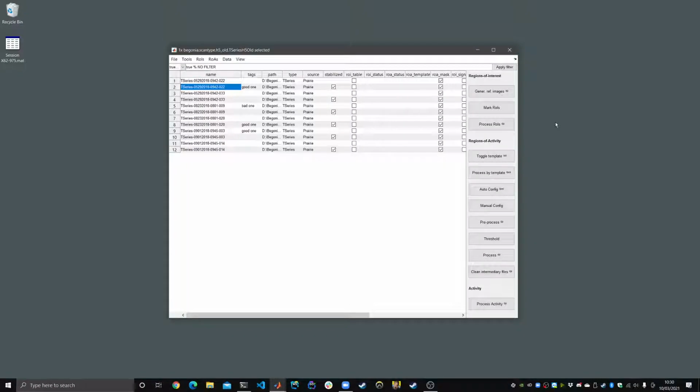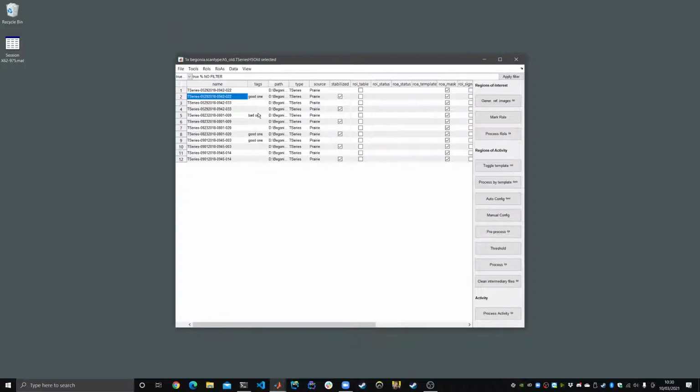In this second video on the Data Manager, we'll have a look at how you can filter data, what data locations are, and also some additional menu options for the data in Dataman.